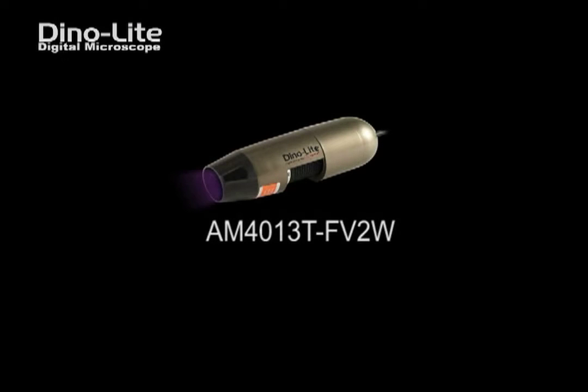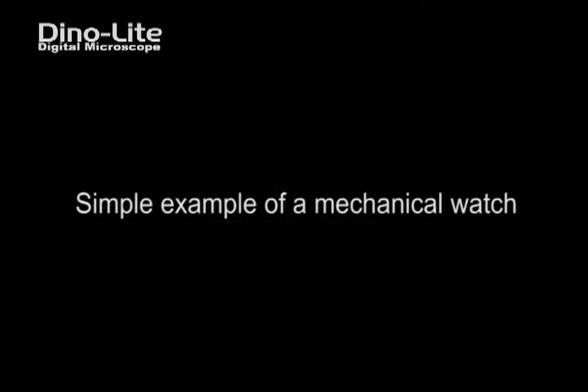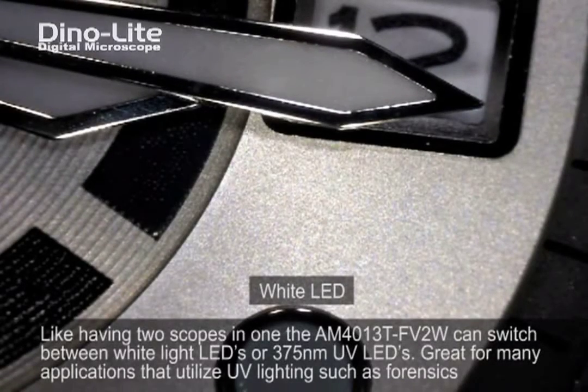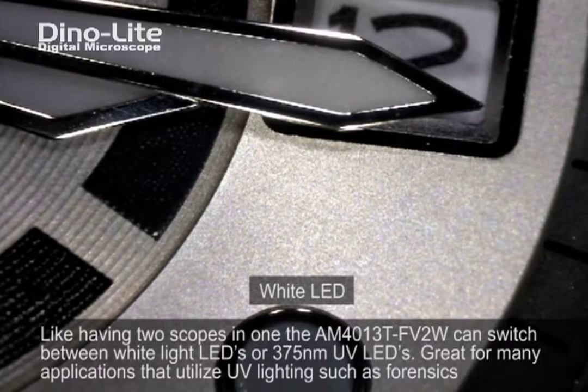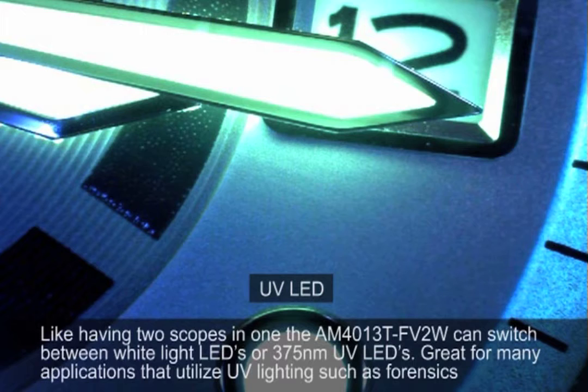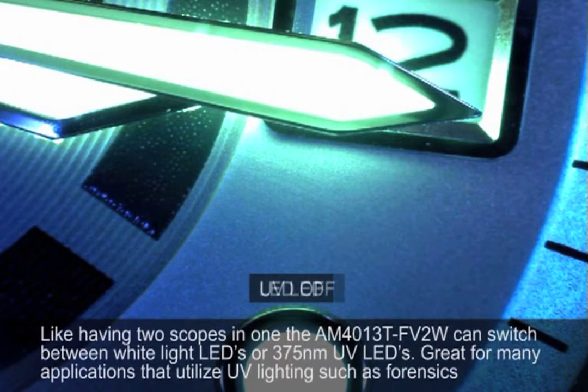Introducing the AM4013T-FV2W. This unique model of handheld digital microscope has a built-in four white LEDs as well as four near ultraviolet LEDs emitting a 375 nanometer wavelength.